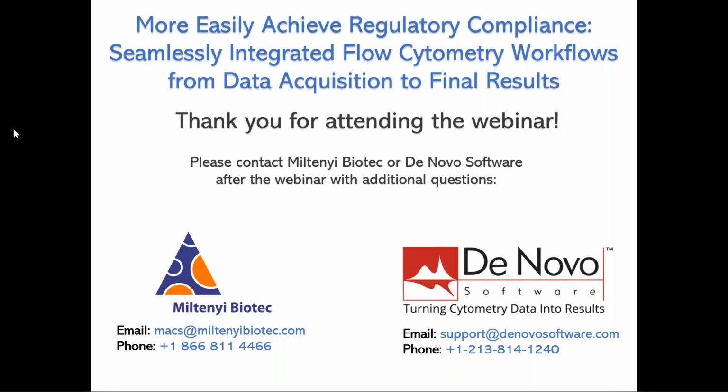However, once the settings are transferred somewhere else, if there's some additional validation, additional work done that creates some improvement, you do have the ability to adjust the settings, save them, and then the settings from that instrument will become the donor settings that can also go back to the original instrument and be installed there as well. So you have the flexibility of working bi-directional, in a way multi-directional.